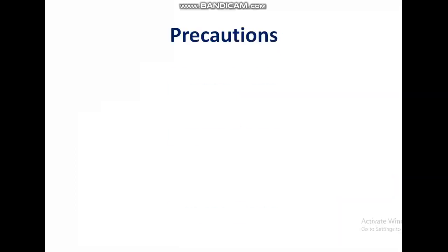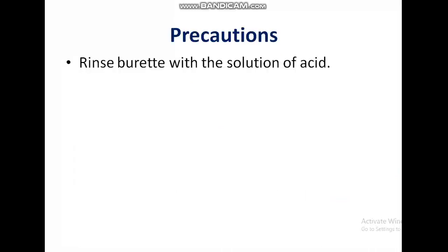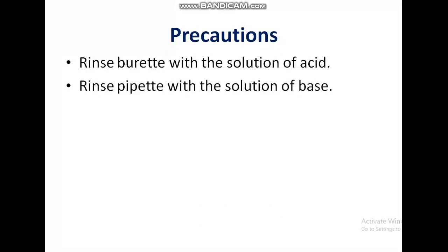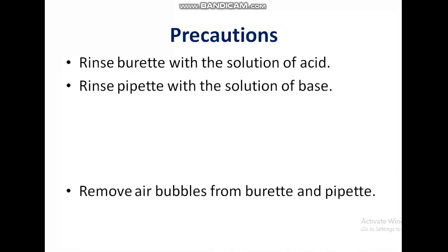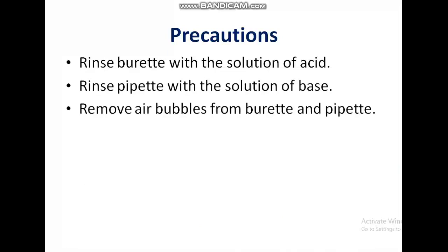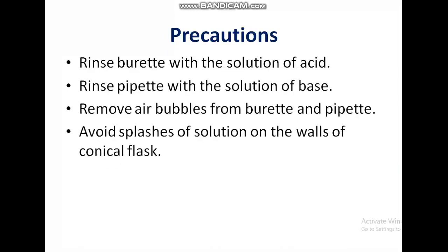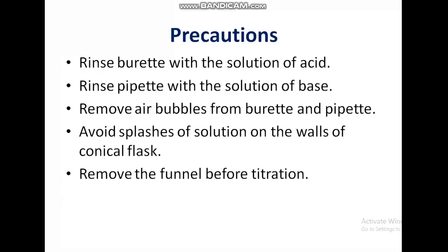Let's look at precautions taken while carrying out titration. 1. Rinse burette with the solution of acid. Rinse pipettes with the solution of base. Remove air bubbles from burette and pipettes. Avoid splashes of solution on the walls of conical flask. Remove the funnel before titration.